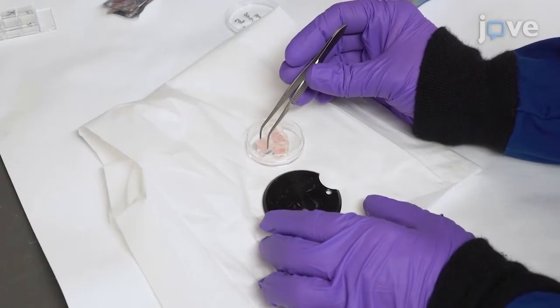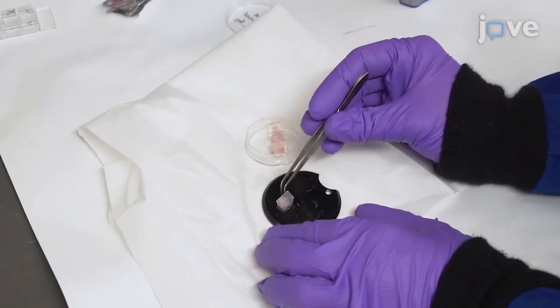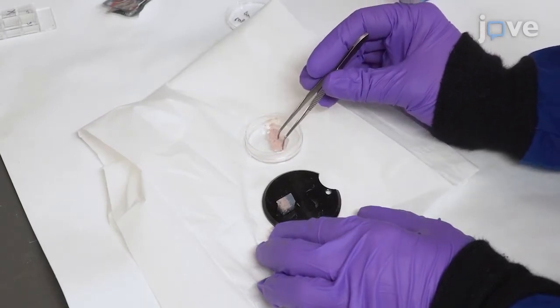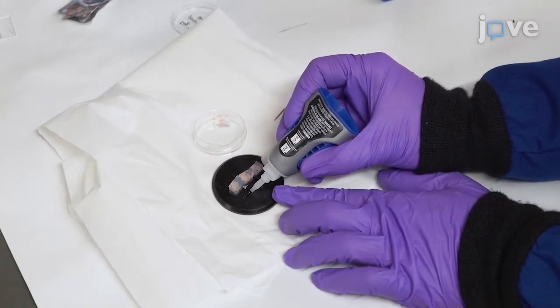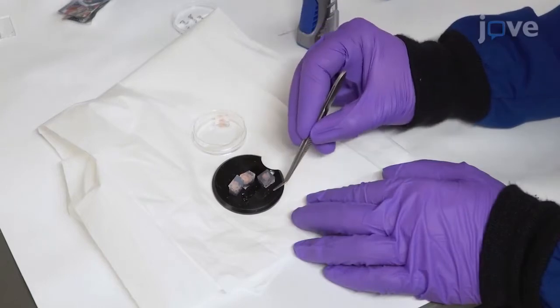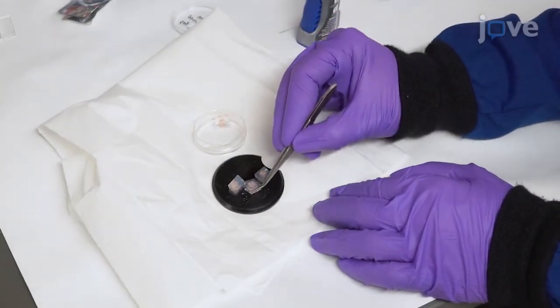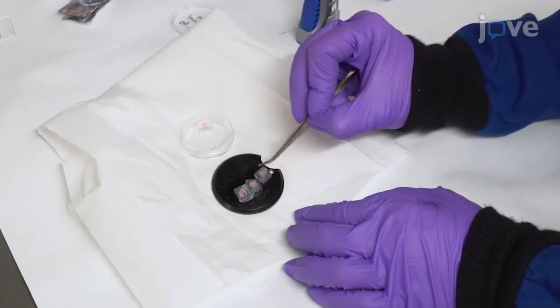To begin, arrange the blocks on the specimen holder in such a way that they do not exceed blade width, ensuring that the blade can move forward the least possible distance when the vibratome moves slowly. Apply a line of superglue on the specimen holder, making a thin layer using the end of the glue dispenser. Then, flip the tissue blocks onto the glue so that the side close to the tissue faces upward. Gently push down the blocks and let the glue dry for 3 minutes.